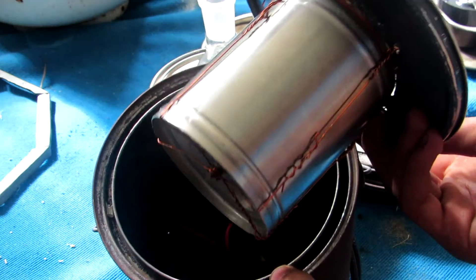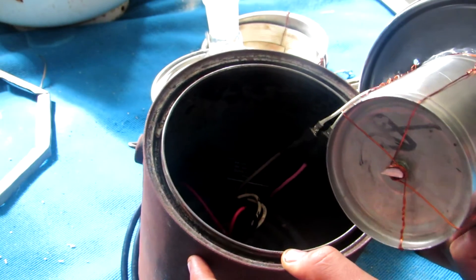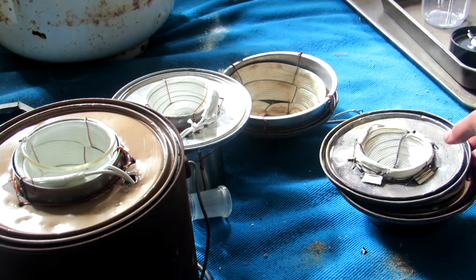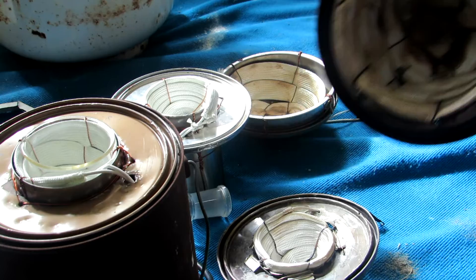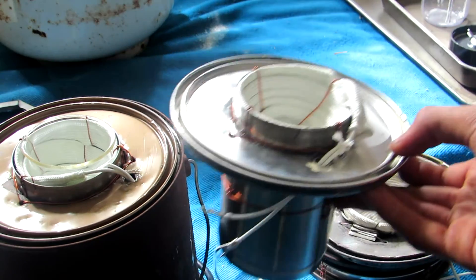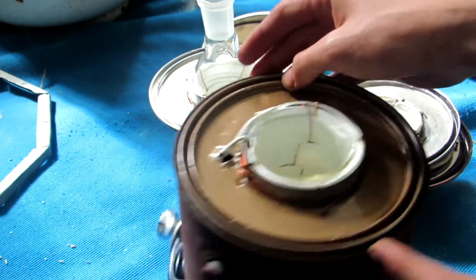Just like the other heating mantles, this one can easily connect to the leads inside the paint can so that different sizes can be quickly swapped out. We now have a normal 100 milliliter, 500 milliliter, and 1000 milliliter heating mantle, plus a high temperature 100 milliliter heating mantle, and a high temperature heating mantle for beakers.